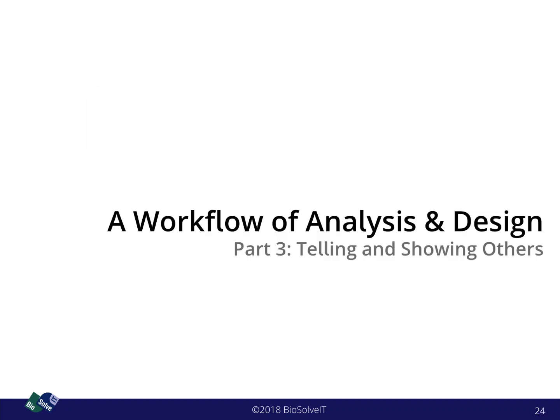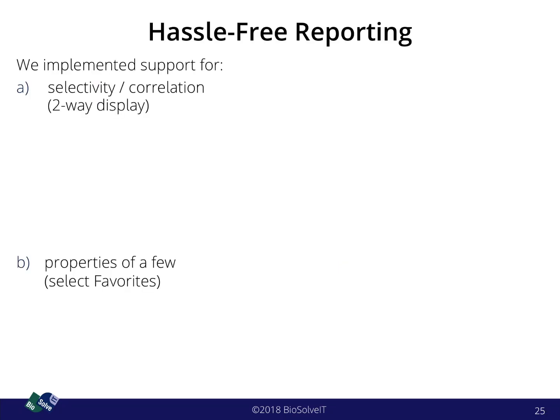So telling and showing others, the reporting, of course, is the closing bracket for this process of analysis and design. Once you're finished, you would like to get an overview. Driven by agile development, which is aggressively driven by priorities, we implemented the two most important use cases that Zealand let us know about.